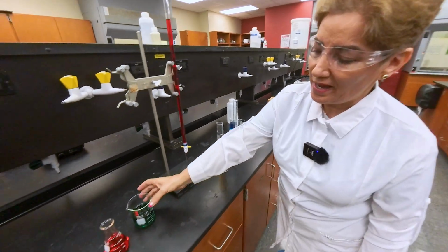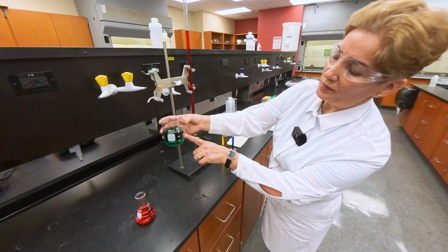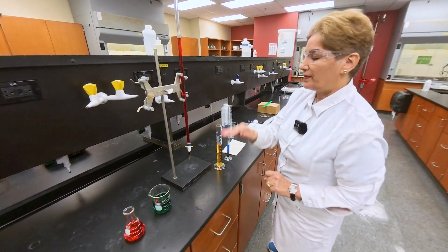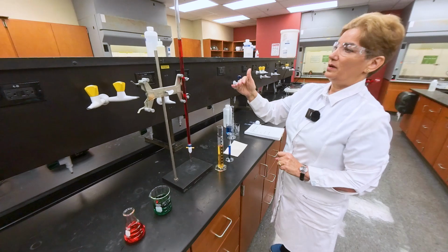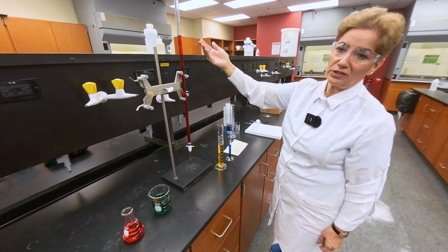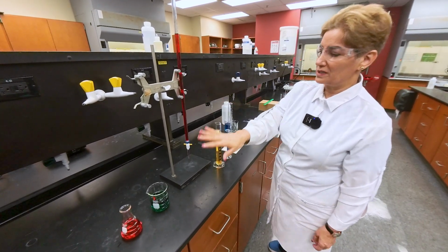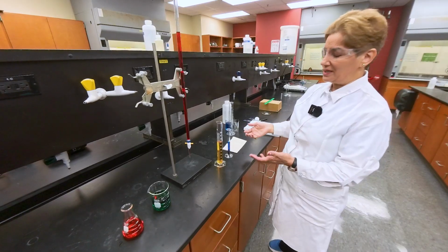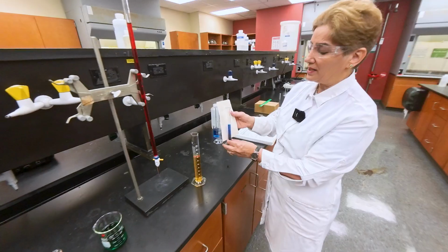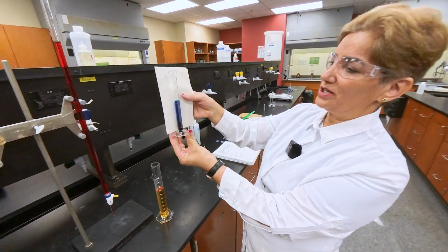We also have numbers that give approximate volume for a beaker and for an Erlenmeyer flask, but the ones that are more accurate for measuring the volume would be the burette, and sometimes we need to use a pipette. Those are most accurate. For the purpose of measurement, we are using these 5 different setups already. The purpose of this part of the experiment is to be able to record the volume as accurately as possible based on the measuring device.